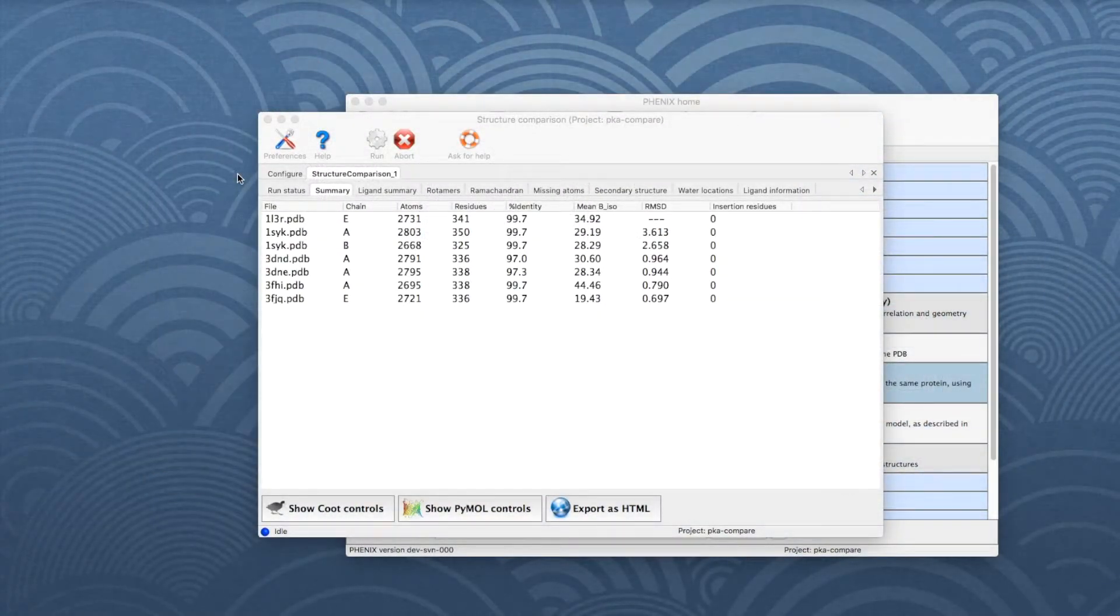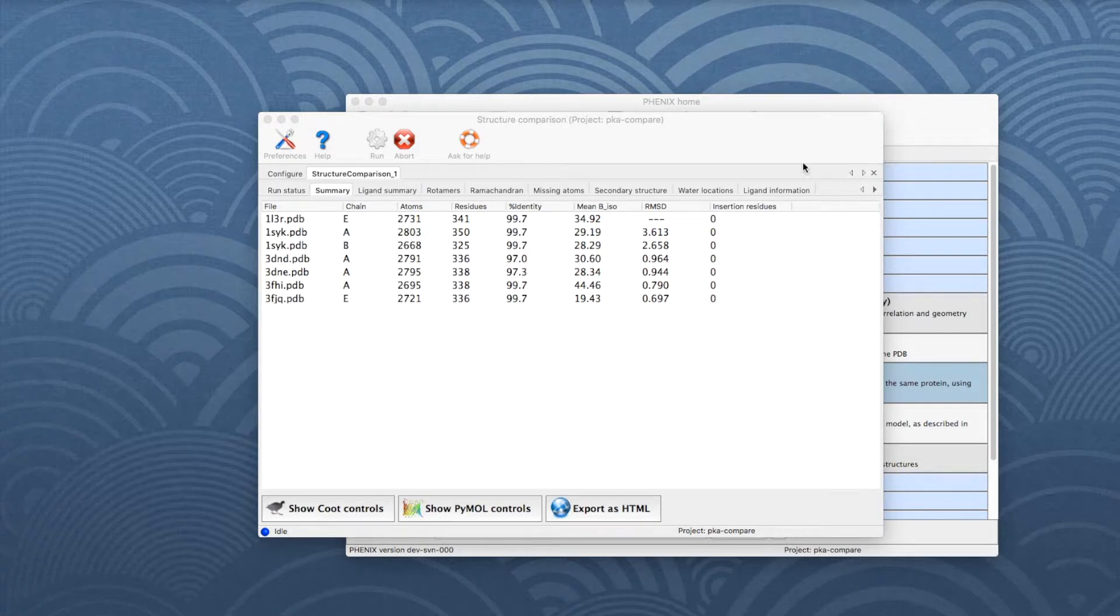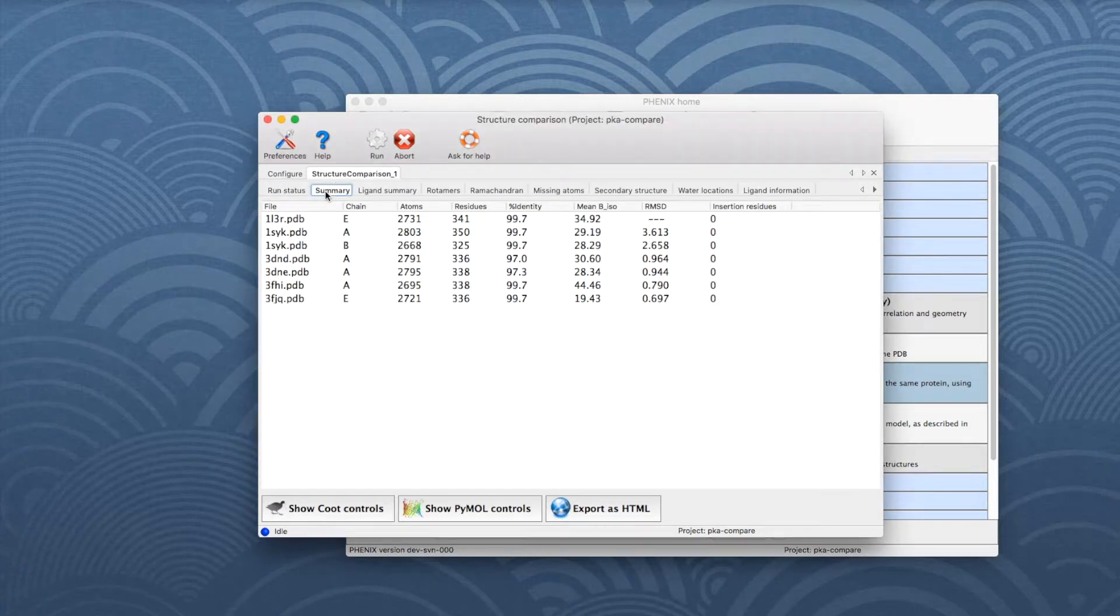When the run is finished, several new tabs appear which summarize the results of the different analyses. Let's start with the Summary tab.